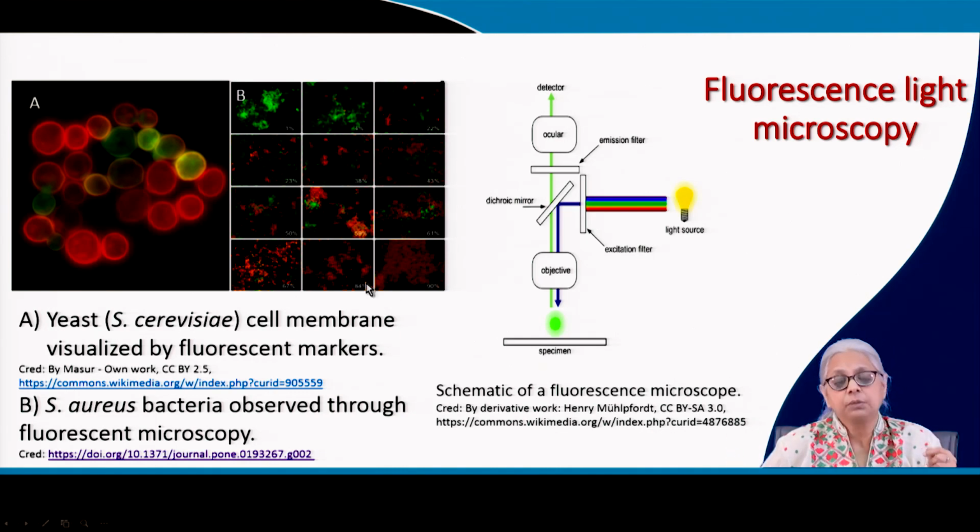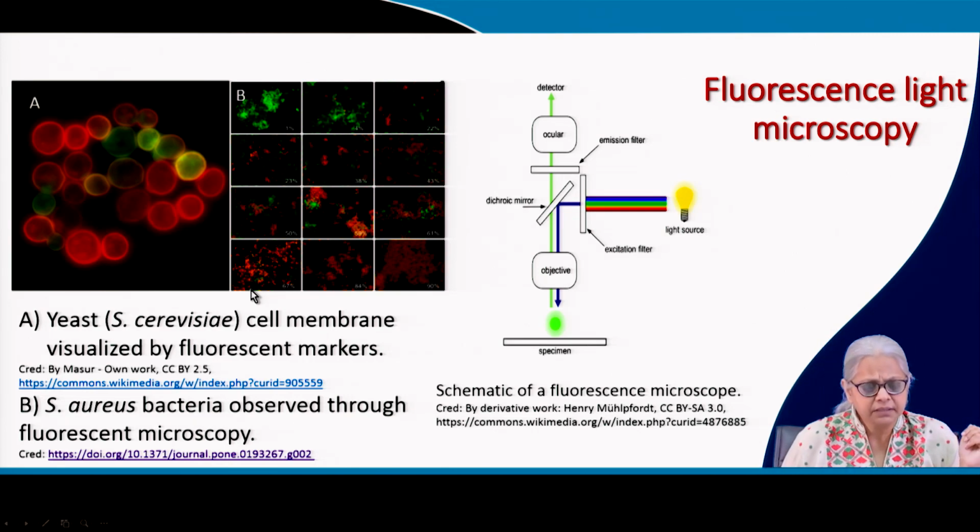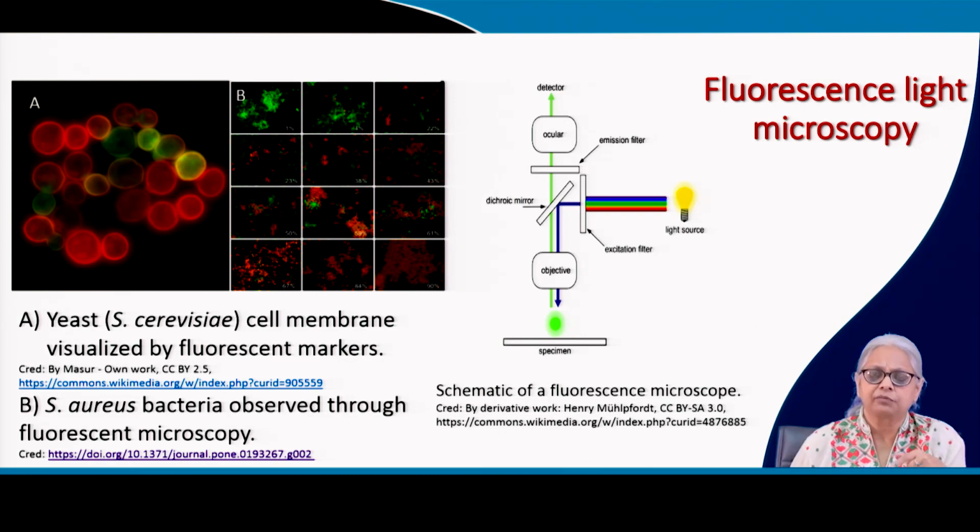And in this particular paper, they have used image processing software to enumerate cells under these different conditions. And those are the numbers. I think it's the number of dead cells that are shown in these series of images, where the green cells are living cells and the red cells are dead cells.